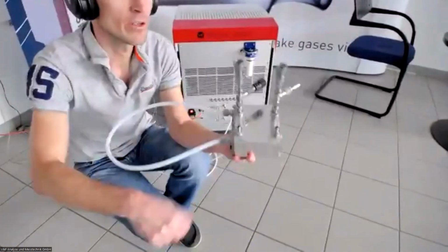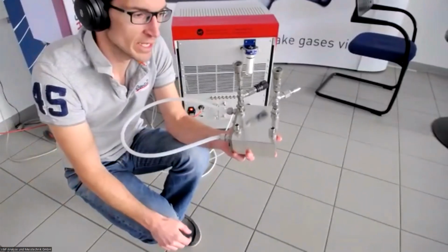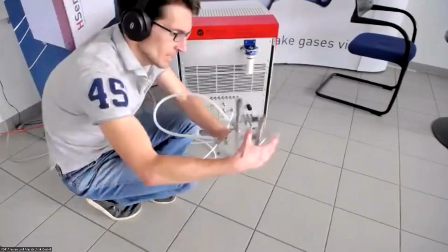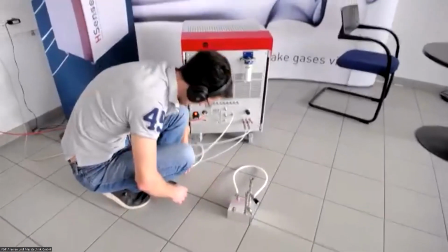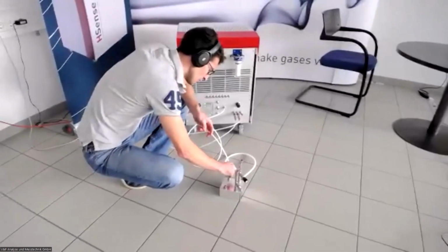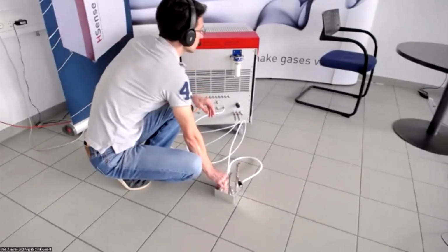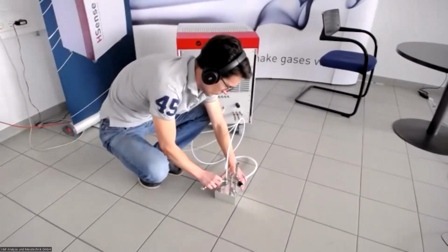Then we have 1 port that we are going to use to connect the instrument, and 1 overflow port where the gas can go outside. So we're going to take the other side of our sample gas line, this one, and attach it to the chamber. Again, tightening it, not too tight.